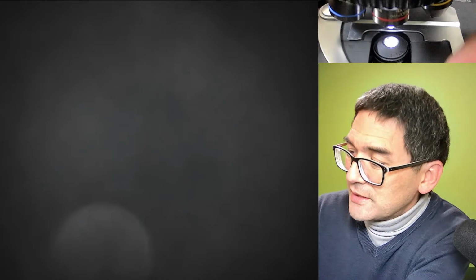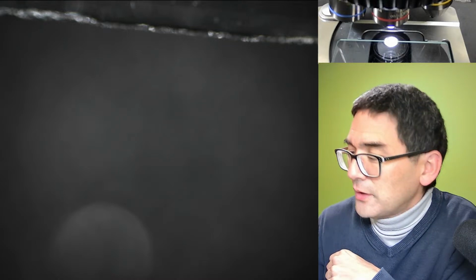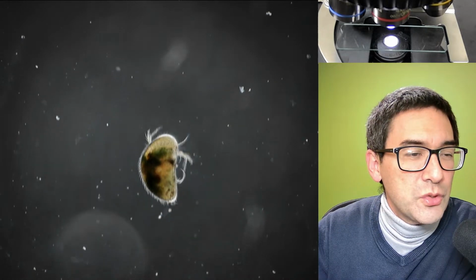I think many of you have already seen this before. So where is this? Oh yeah, here it is. You of course know this one. This is an ostracod. It's a crustacean. You know what? I kind of like the dark field. And I think I'm just going to leave it here.